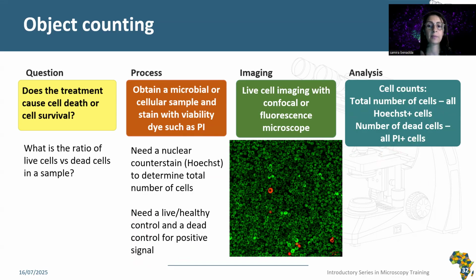So it's very important because now we can see if the new drug is toxic, and it's interesting. So we can do a test of viability and see if my drug kills or not my cells, for example, in cancer cells or in bacteria or other diseases.